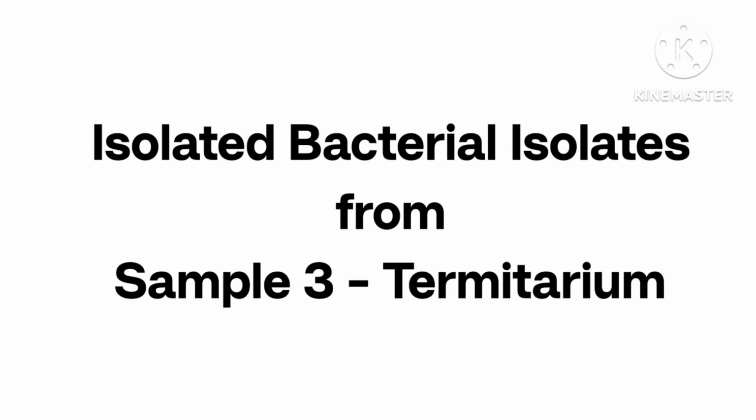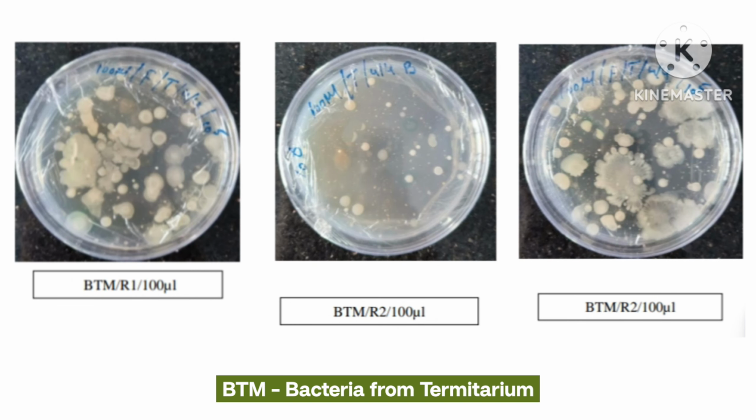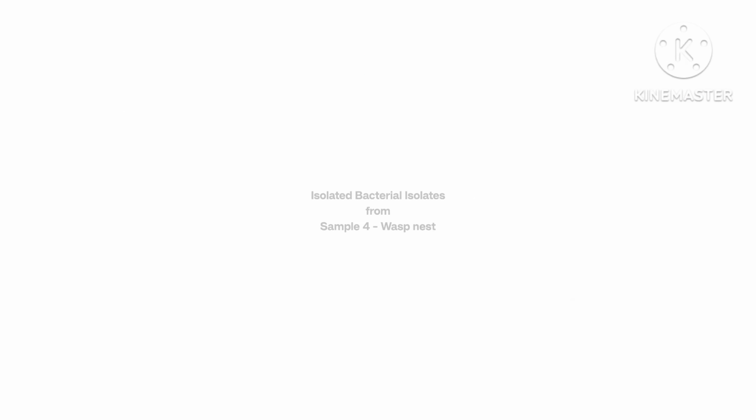Isolated bacterial isolates from sample 3, Termitarium. Bacterial isolates from replication 1, 2 and 3 under 10^6 dilution. Bacterial isolates from replication 1 and 2 under 100 microliter dilution.